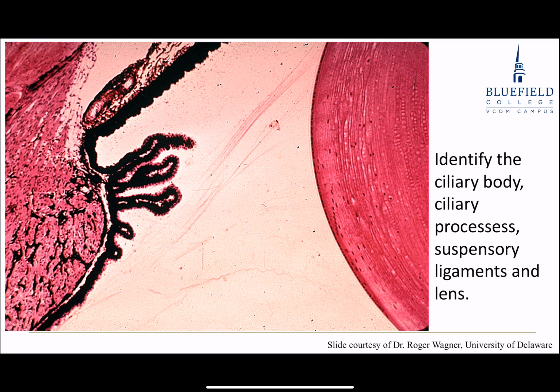The stroma has fibroblasts in it, also has a lot of melanocytes to give the iris its color, but the posterior surface of the iris is a stratified cuboidal epithelium continuous with that stratified cuboidal epithelium of the ciliary processes, except now both layers are highly pigmented. And so that's one thing that can help you recognize that. If we point to a pink section up here, all you have to tell me is that is muscle that controls the aperture of the pupil. And I'm going to ask you, is that constrictor or dilator?